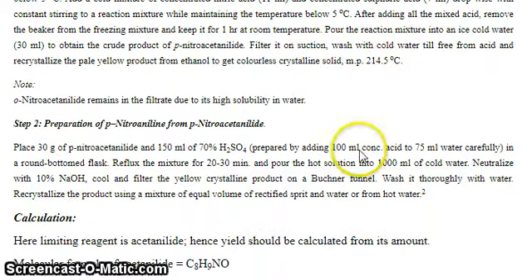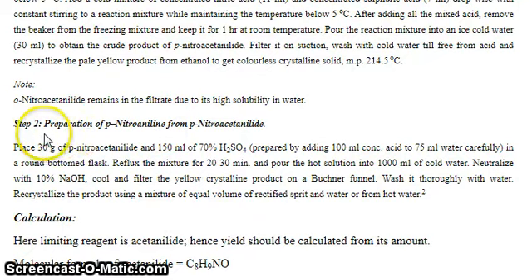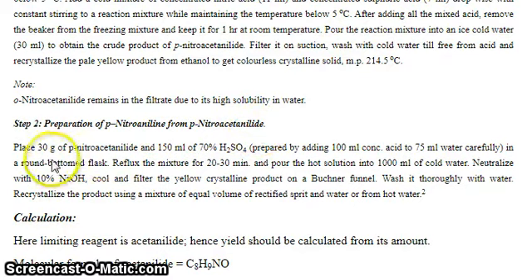Recrystallize the pale yellow product from ethanol to get a colorless crystalline solid. Check the melting point: 214.5°C. Note that orthonitroacetanilide remains in the filtrate due to its high solubility in water. Now for step two, the preparation of paranitroaniline from paranitroacetanilide.